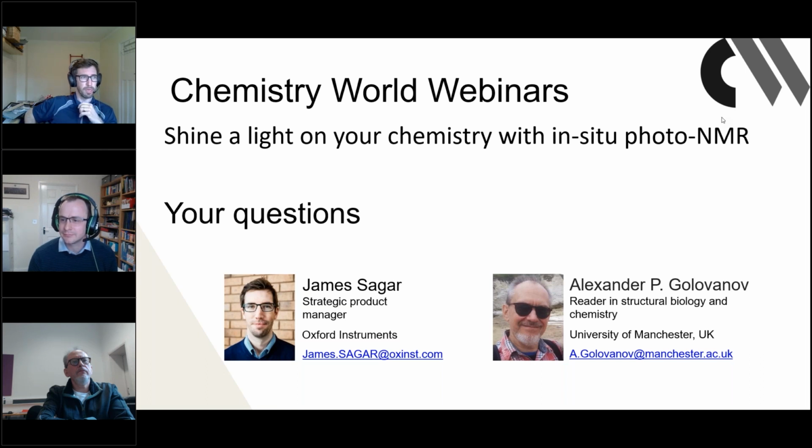Brilliant. And just to drop in there, Philip, there's a question about whether you can use this with potentially larger sample size time domain instruments. And I think that generally the principle is yes, you can. We haven't done that as yet. Sasha hasn't done that as yet because he's focused on spectroscopy, but you can understand that with that larger sample size, you may struggle sometimes to get the light right into the center of that sample, but actually, there's things you can do to mitigate that.